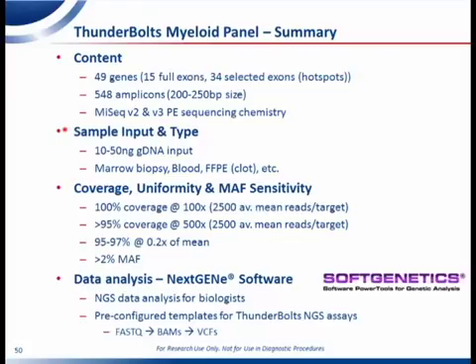So I have a question for Eric. In your preliminary study, you added 20 samples for a run. Is that your typical throughput you project to run, or do you intend to index a smaller number of samples per flow cell? Because we're performing research grade targeted sequencing, we actually hope to get it up to 42 and even 48 on a typical MiSeq run. What we'd really love to do, especially in those 96 well experiments, is to be able to, in a couple of runs, take a full 96 well plate to NGS, and so I'm hoping, and I'm confident, that we'll be able to get even higher.